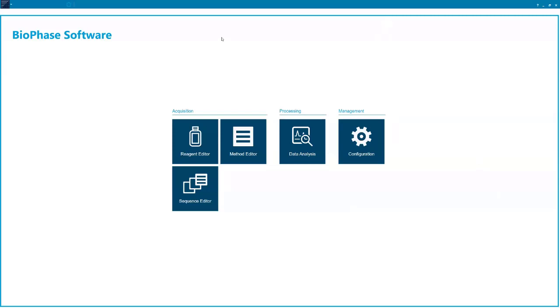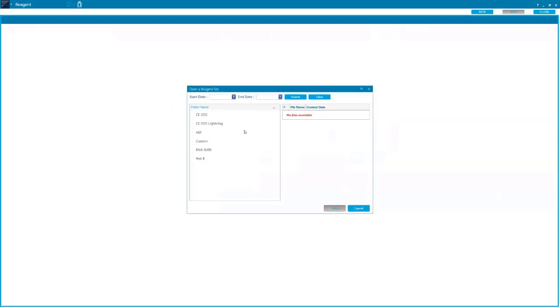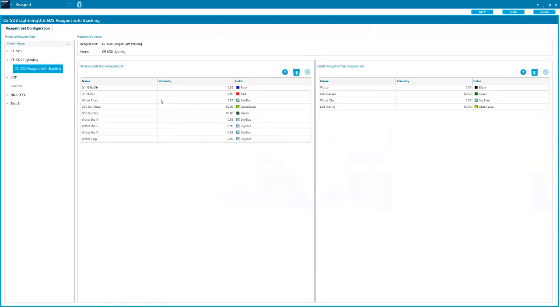So the BioPhase 8800 system is a little different. Actually, it's a lot different than any other chromatography data system software that I've used in the past. It's a lot different than 32 Karat, a lot different than Empower. And one of the things that we start off different is our reagent editor. Reagent editor is where we actually define what reagents we're going to be using. We open up one of those reagent files, what we can see is we have to define all the reagents that are going to be used on our inlet or outlet sides for our assay.